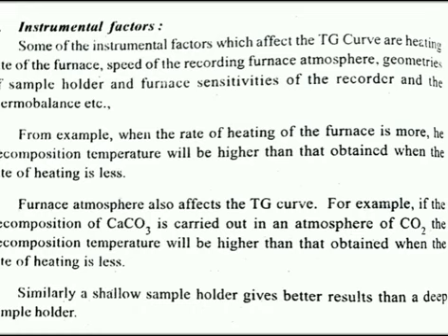Furnace atmosphere also affects the thermogravimetric curve. For example, if the decomposition of calcium carbonate is carried out in an atmosphere of carbon dioxide, the decomposition temperature will be higher. Similarly, shallow sample holders give better results than a deep sample holder.